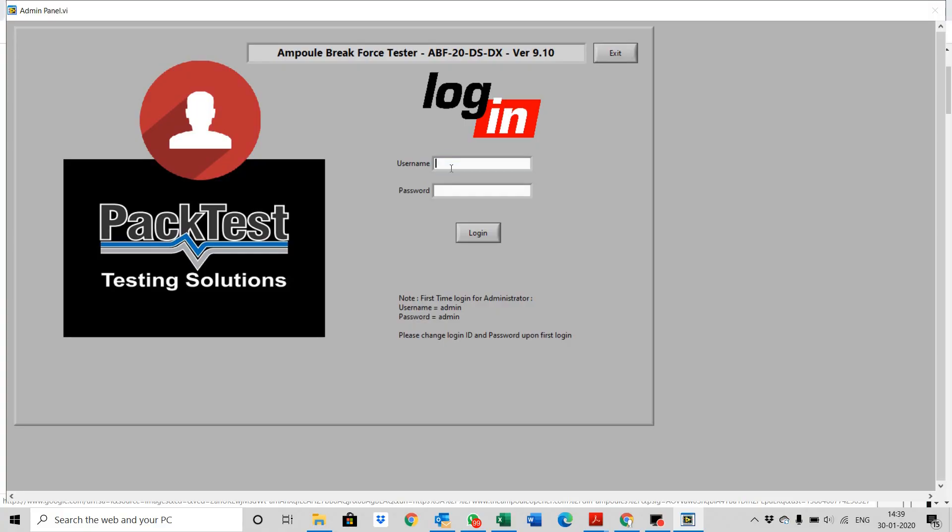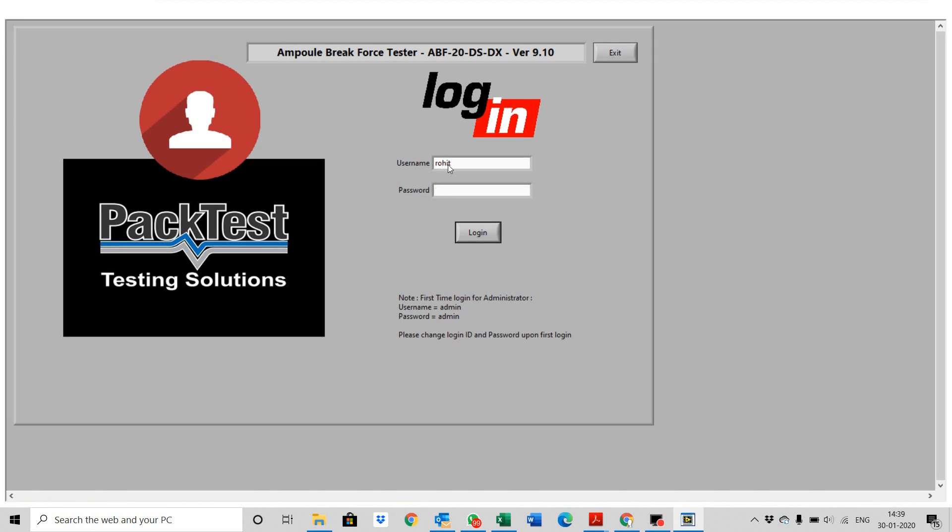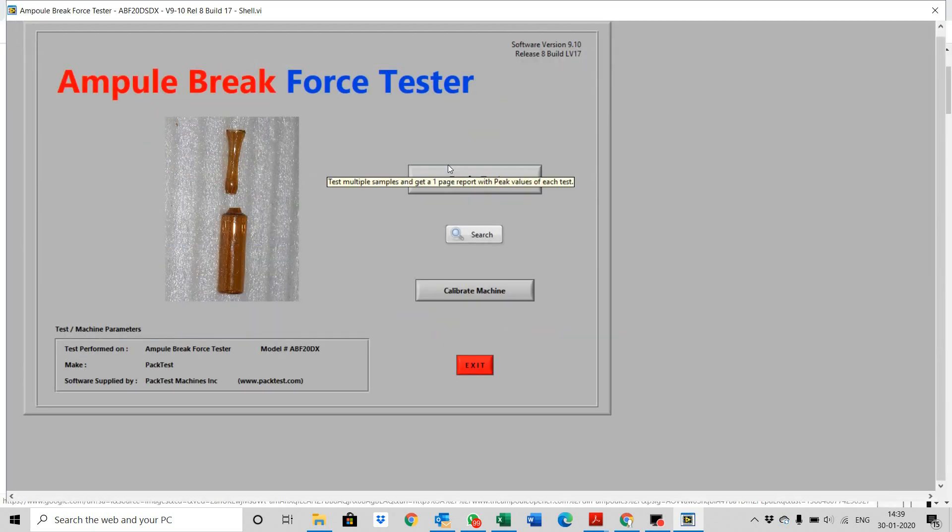Start the software. Log in with your credentials. Select begin test.